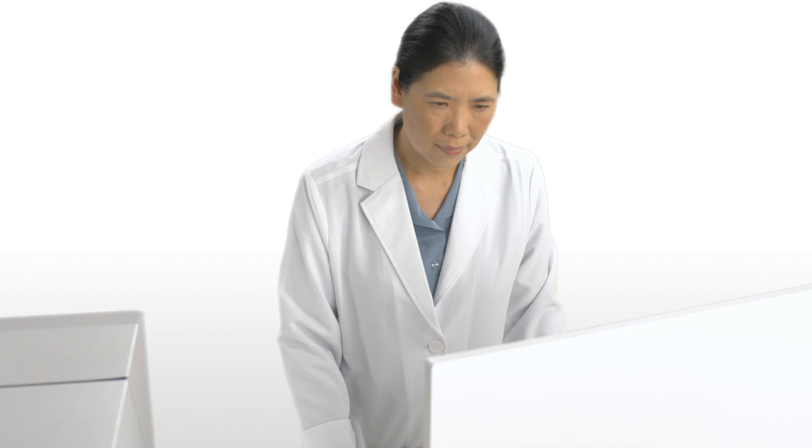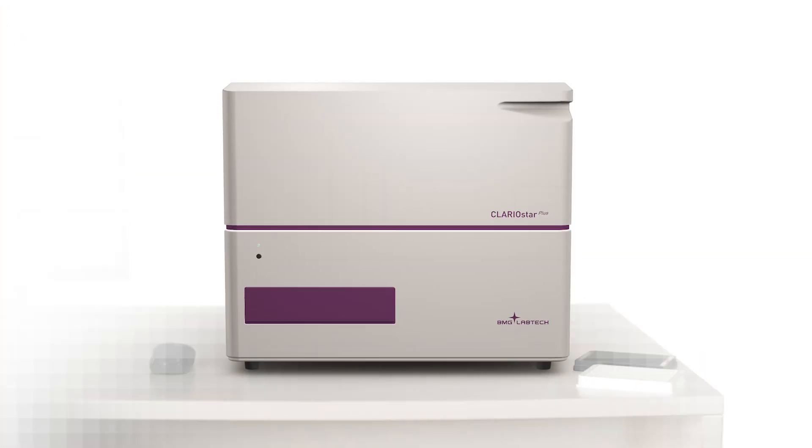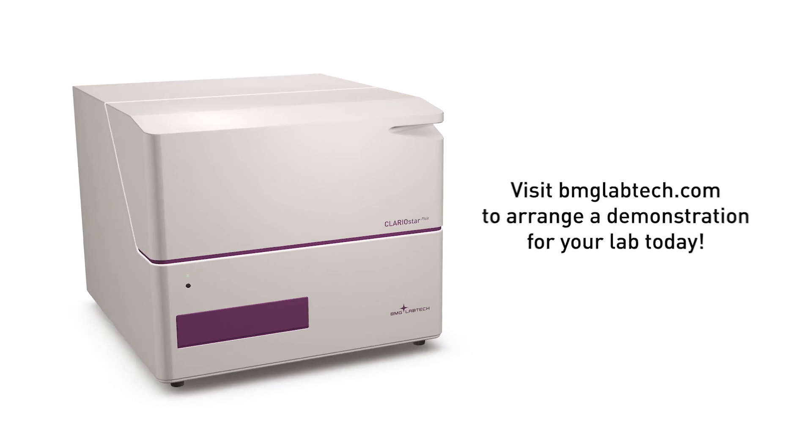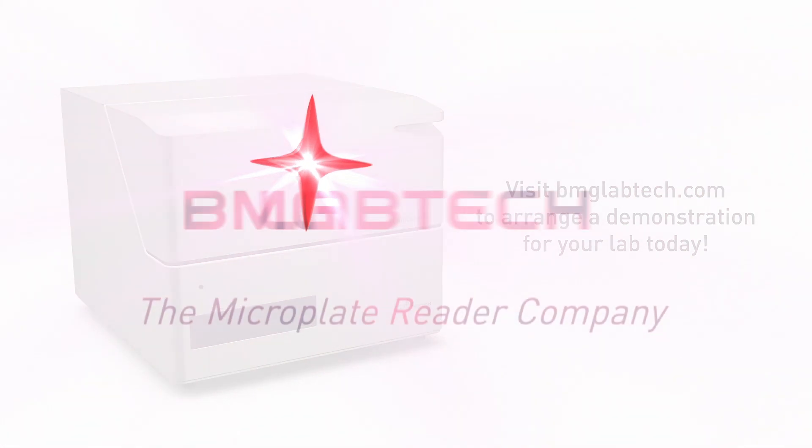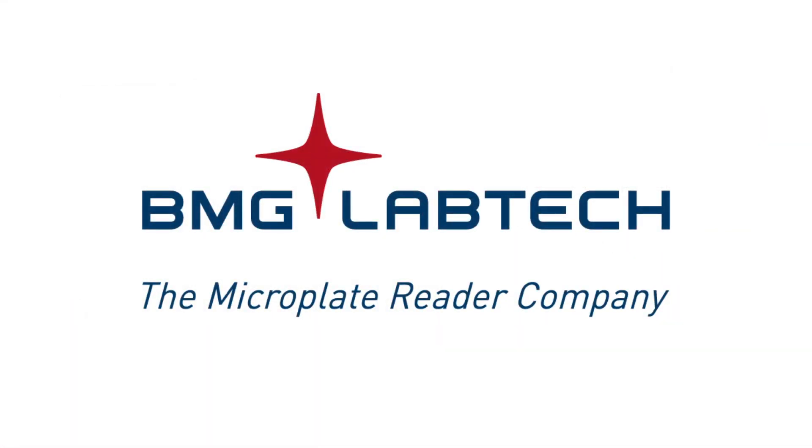The new ClarioStar Plus is the most versatile instrument for all laboratory applications. Contact BMG LabTech today at bmglabtech.com to arrange a demonstration for your lab. BMG LabTech, the microplate reader company.